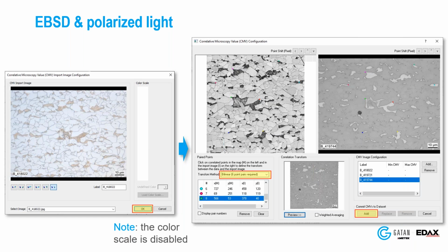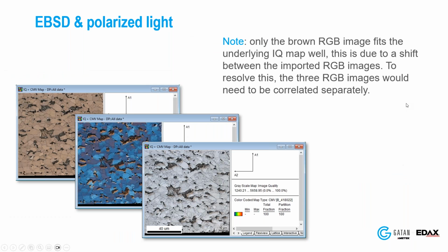And you can see each time I've used bilinear here. We also have a quadratic fitting if there's a lot more distortion. To be honest, the images I've done so far I've been able to do with bilinear just fine. And the quadratic, I haven't really used it very much. So I have my 3 images. In this case, it was a lot easier to work with them in grayscale than color for whatever reason, but I was able to do that.